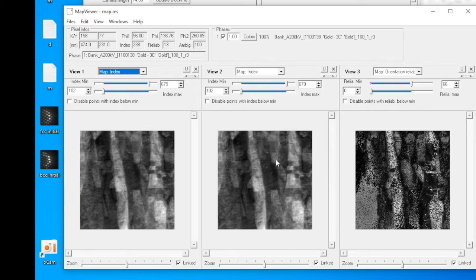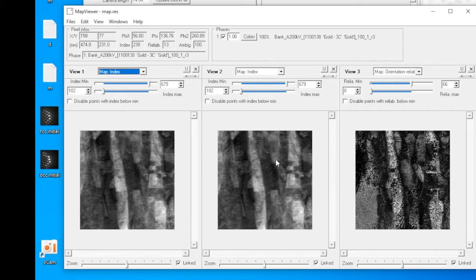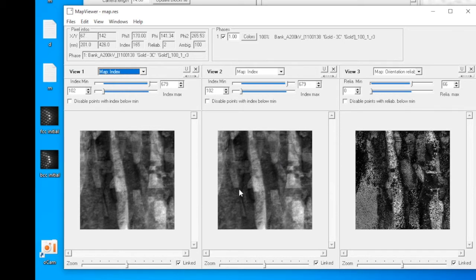Let's think about when we'll have a good match, when we'll have a bad match. The good match usually happens inside the grain. If you have a grain boundary or phase boundary, then at the boundary there will be two sets of diffraction patterns. Then the match wouldn't be so good, and it will appear dark. Therefore, Index Map is a very powerful technique to highlight interfaces in the microstructure.